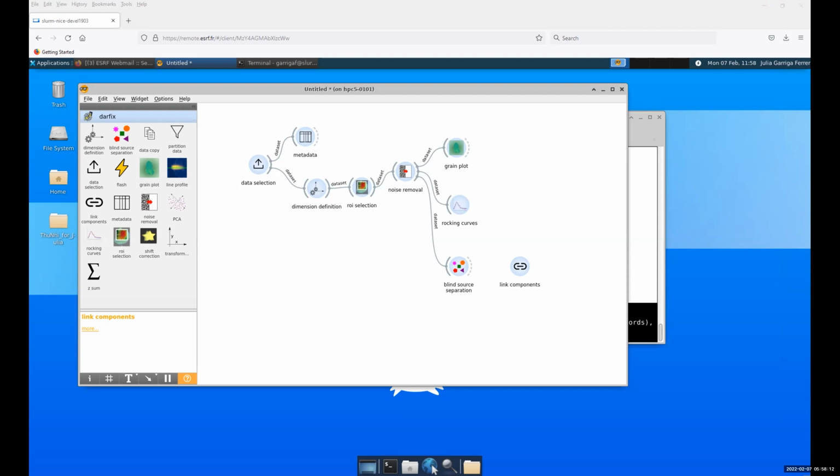And the number of grains? We recommend taking your grains one at a time, but in one week you can look at a couple of grains. But how do you deal with the overlap? There should not be too many grains. In a polycrystalline material, normally the orientations differ, right? They are not all oriented the same, so there is not this issue.